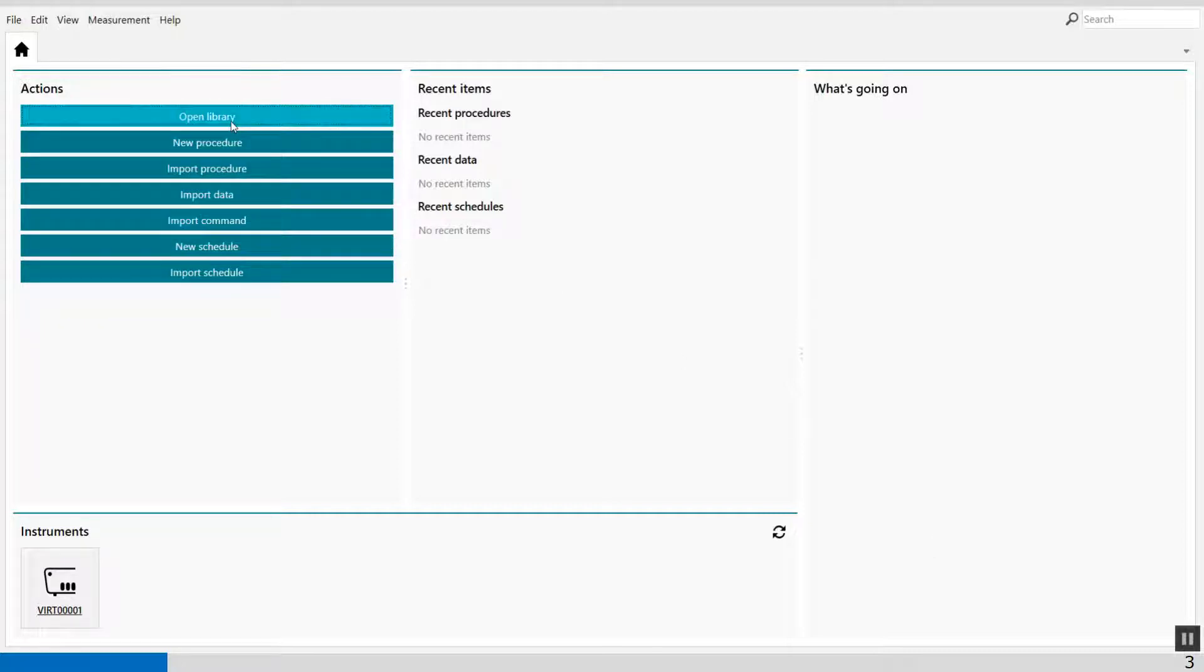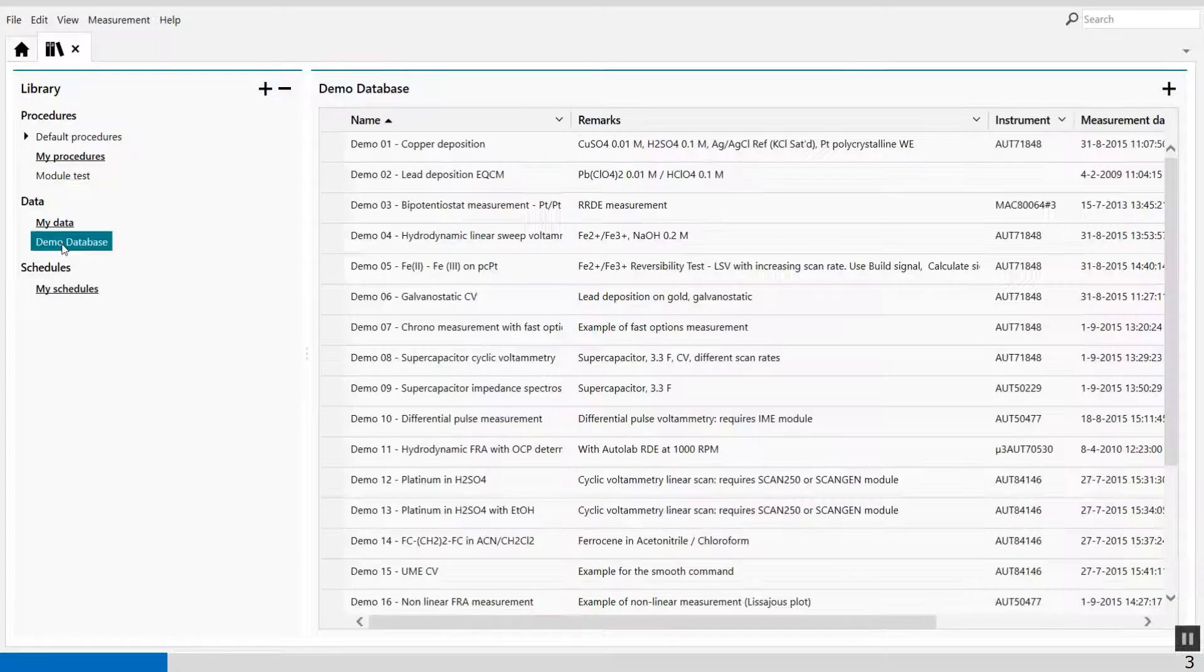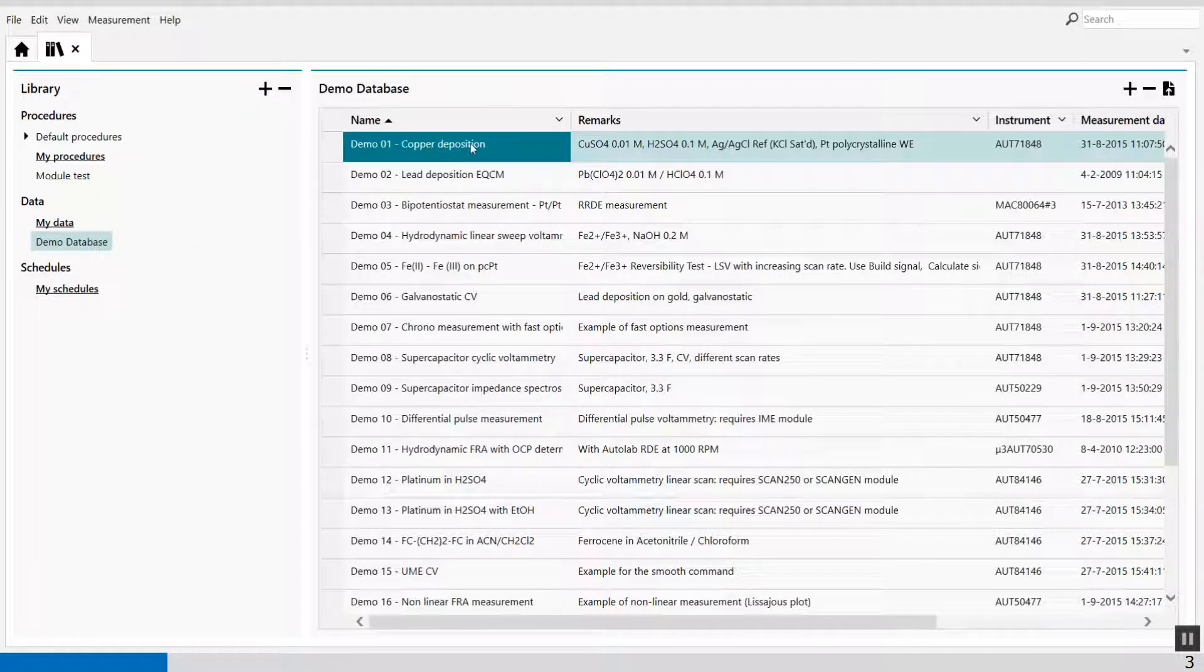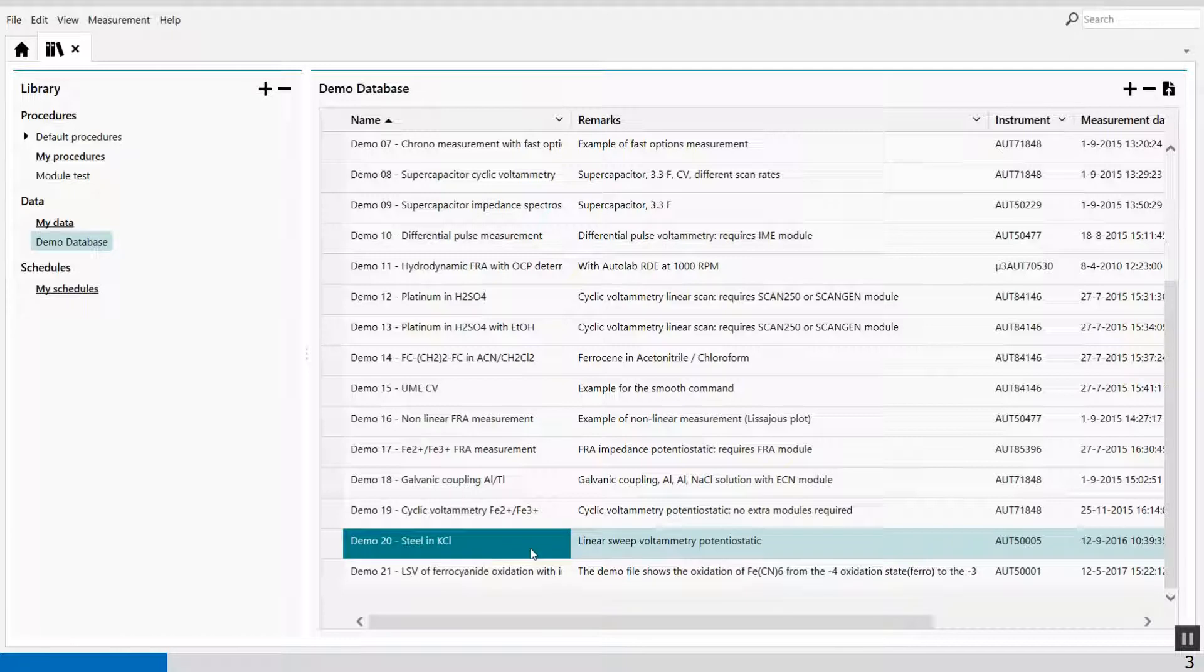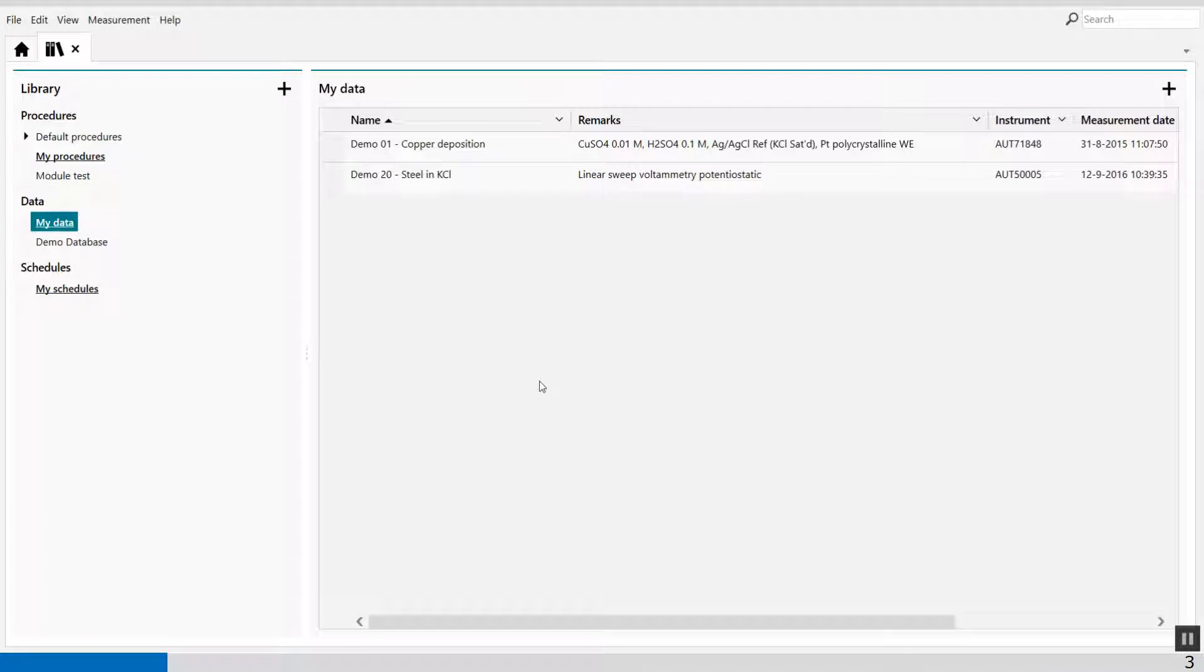So when I go to library, I have my demo database. In demo one, I will see my copper deposition. And in demo 20, I have an LSV in steel of KCl, for example. I've copied these files into my data, and here I can merge the two files together.